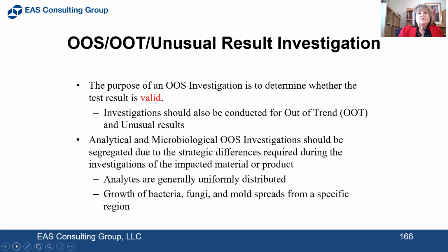The purpose of an OOS investigation is to determine whether the result is valid. Investigations should also be conducted for out of trend and unusual results. Analytical and microbiological OOS investigations should be segregated due to the strategic differences required during the investigations of the impacted material or product.